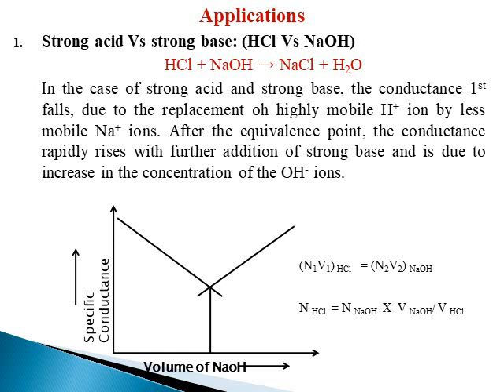Now, after the consumption of H plus from HCl, what you have to do is, after getting the end point, further you are going to add sodium hydroxide. That is what I said in the previous sentence. After the consistent decrease, you have to get a significant increase.